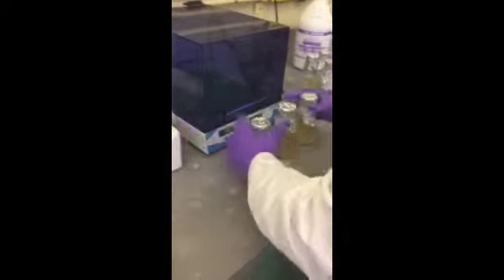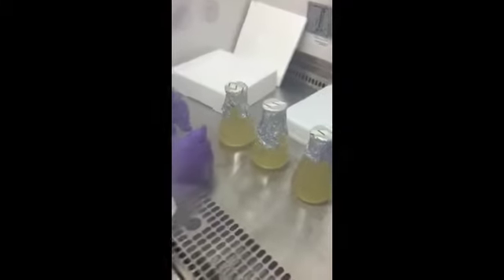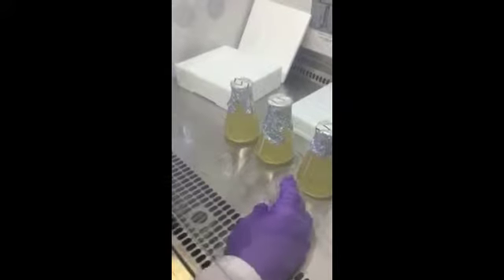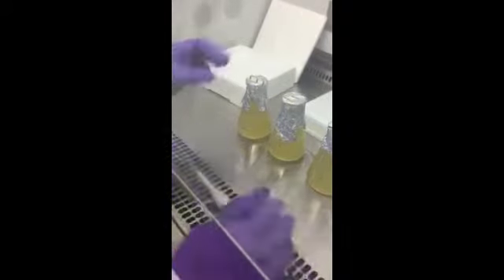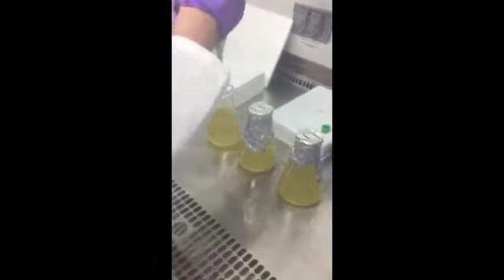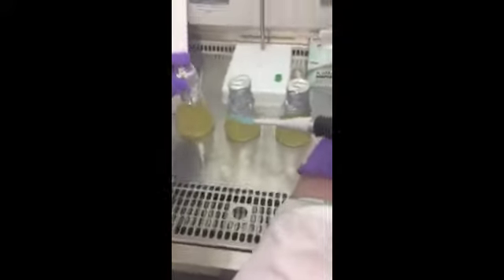Every 30 minutes for 8 hours, a sample must be taken from the flasks in the benchtop shaker. Remove the samples and make sure to close the lid of the shaker. Bring the samples into the biosafety cabinet. Micropipette 1 milliliter of each sample into a cuvette. Be sure to change the pipette tip between every sample.